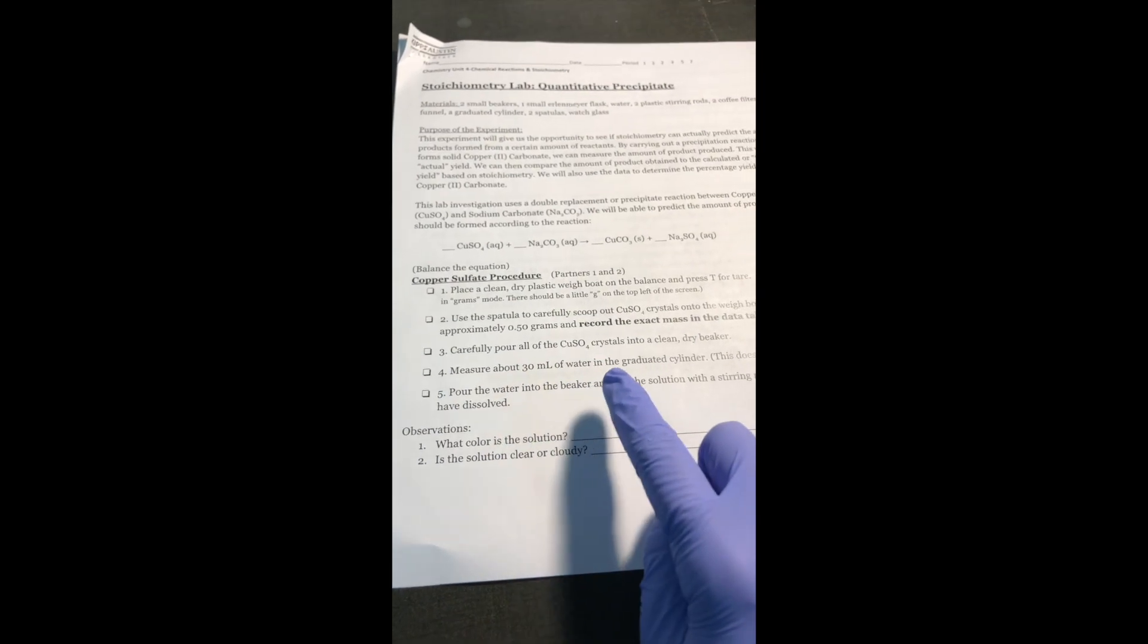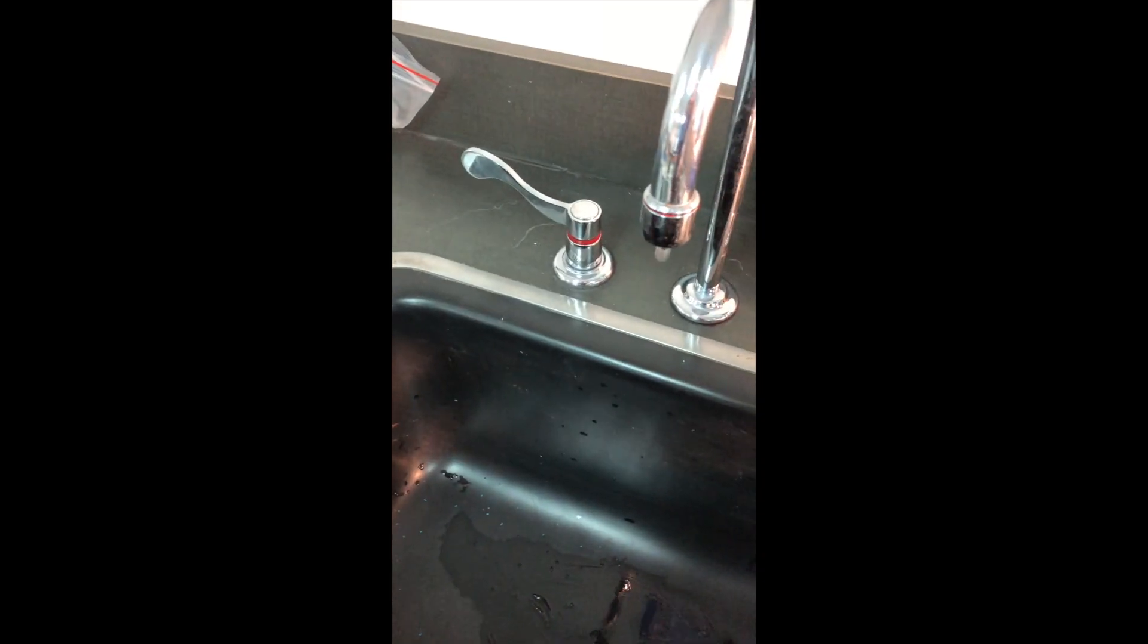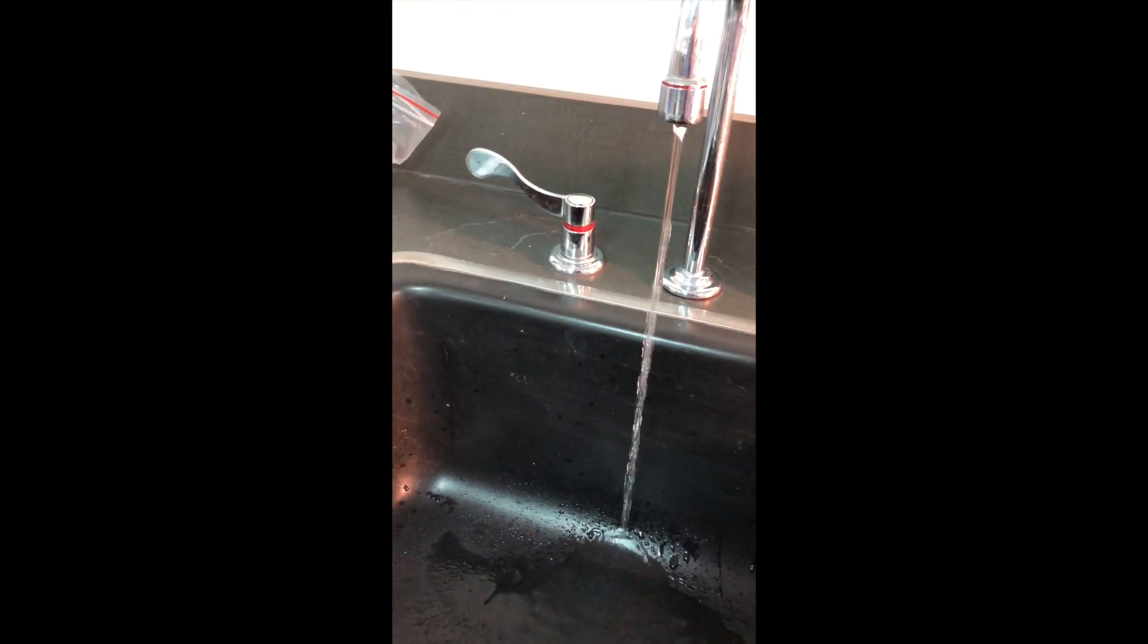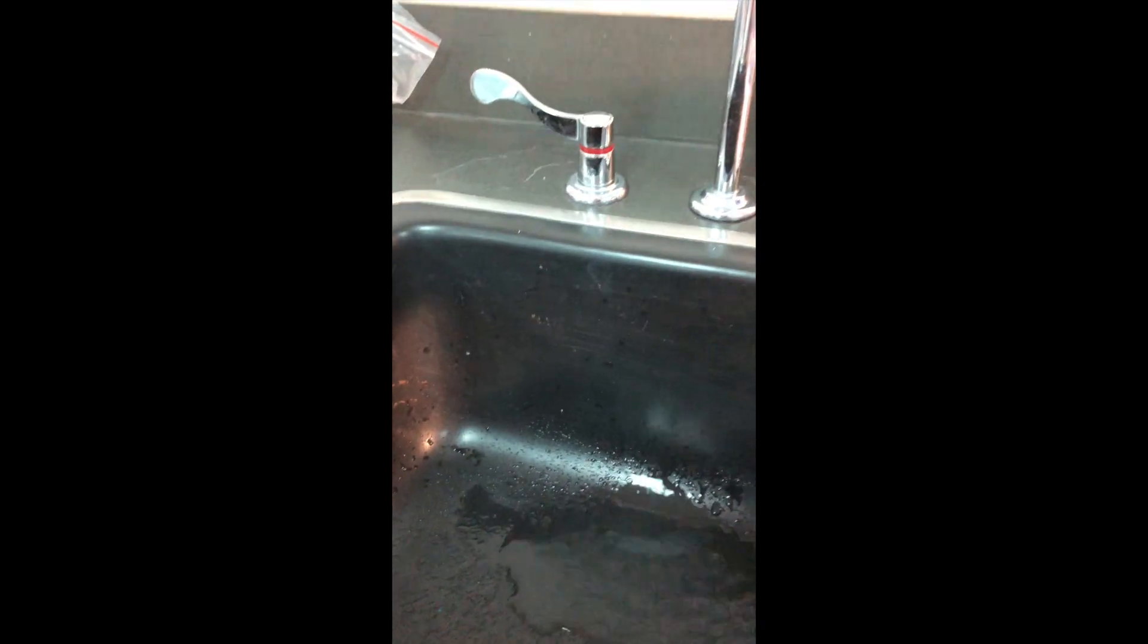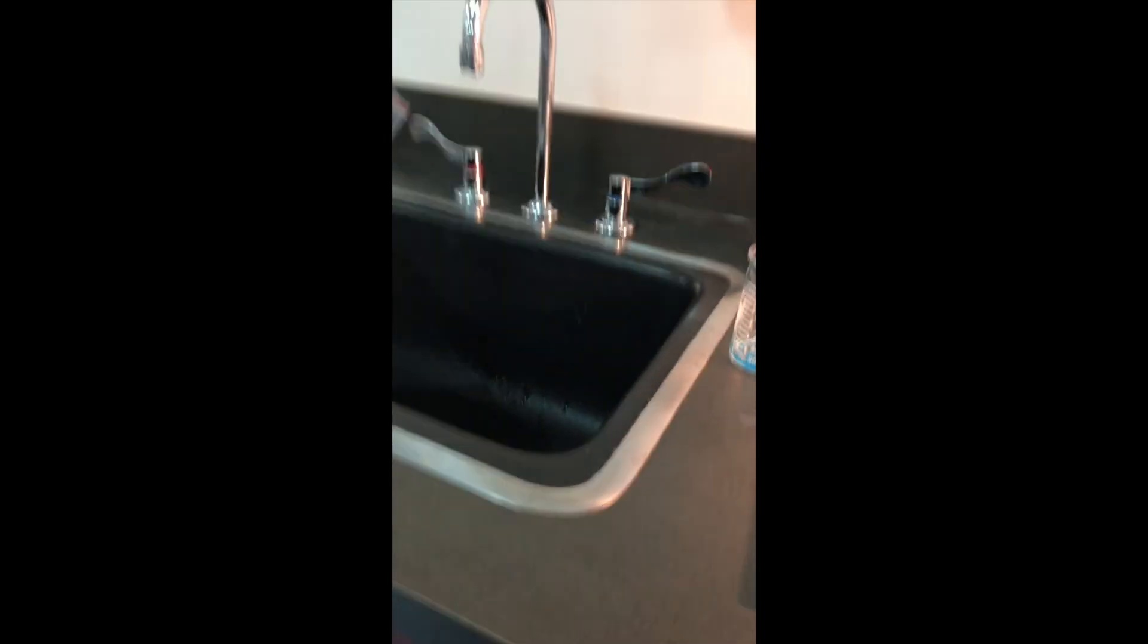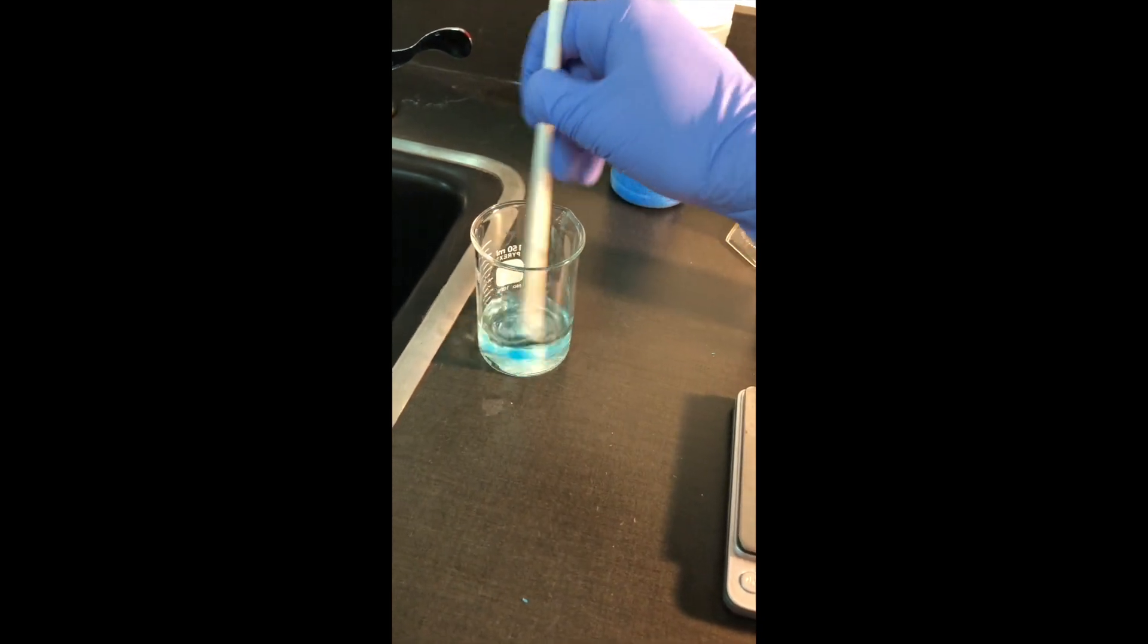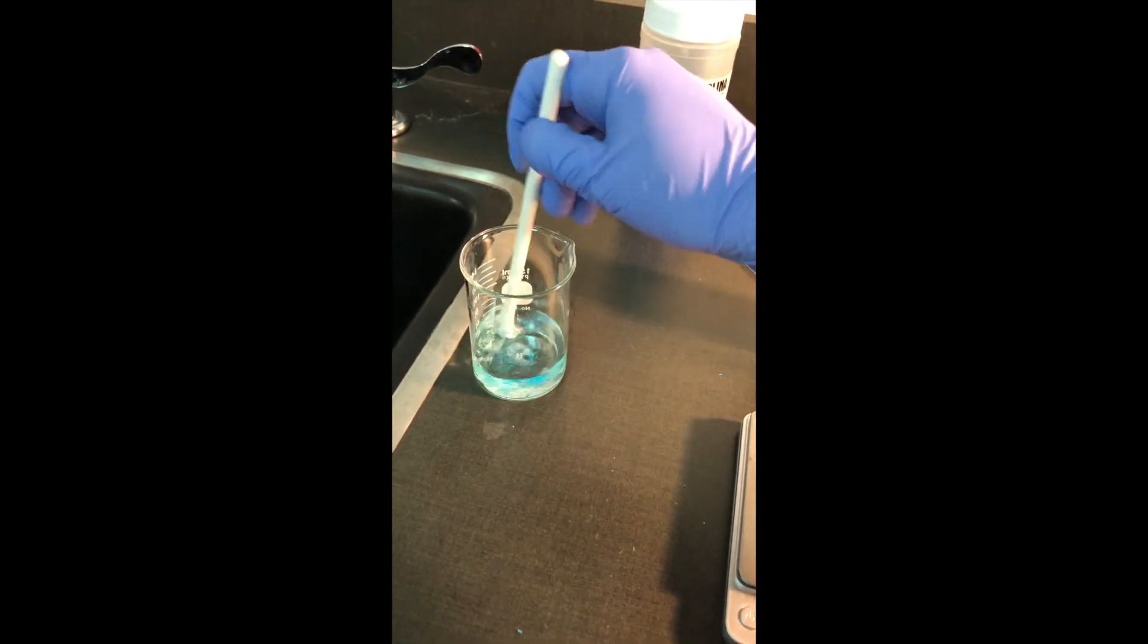Next step, measure about 30 milliliters of water in the graduated cylinder. This does not need to be exact. We're not making any super special solutions that have to be exactly a certain volume. So I'm just going to get this close, overshot a little bit, pour some out. Close enough. It needs to be just probably between 30 and 35 milliliters. The next step says pour the water into the beaker and stir the solution with the stirring rod until all of the crystals have dissolved. And we'll pour it in here and stir until all of these crystals have dissolved.